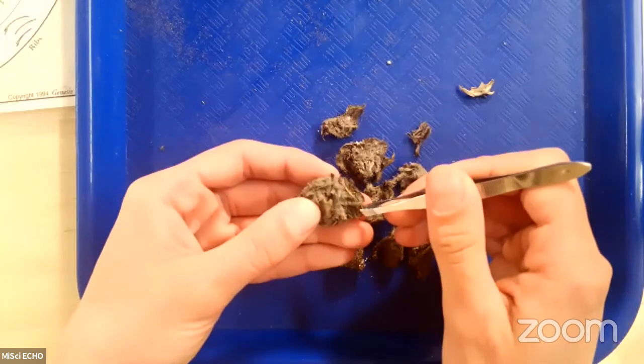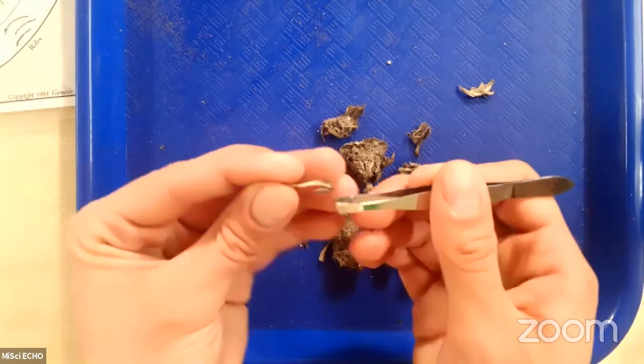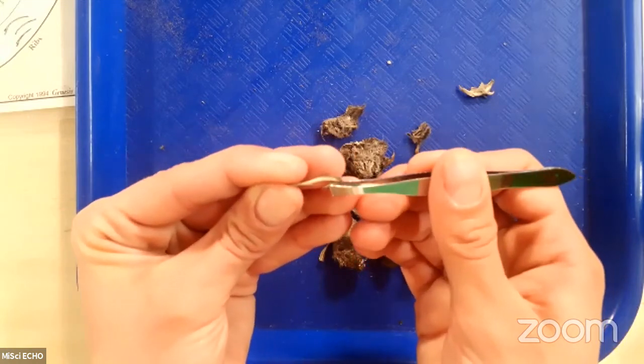This is one of those dissections that takes a good amount of patience because there are just a ton of stuff packed inside these owl pellets.